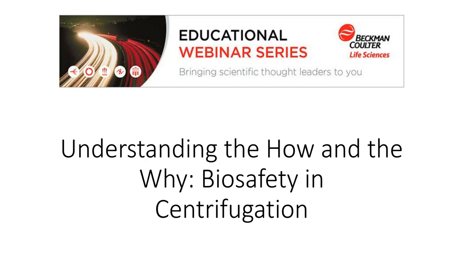Keep in mind though, bleach will bleach your rotor and it will whiten it over time, but that's not a structural problem. It's just more of a cosmetic issue. But 70%, if that's what you're using as a disinfectant, is fine. Yeah, and I'll add, anytime you use 5% bleach, you have to then clean with 100% water to make sure you remove any of the residue from the bleach.